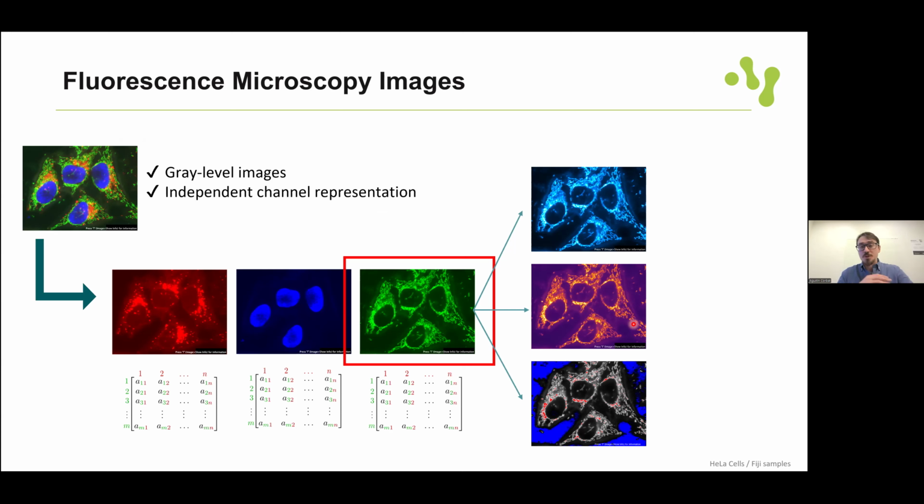What they do is change the range of colors to highlight different things. And my personal favorite, which you have seen quite a lot of times in the course, is the high-low, which is a grayscale channel for most of the values, but it will show in blue color for whatever is 0 or below 0, and in red for whatever is at saturation.